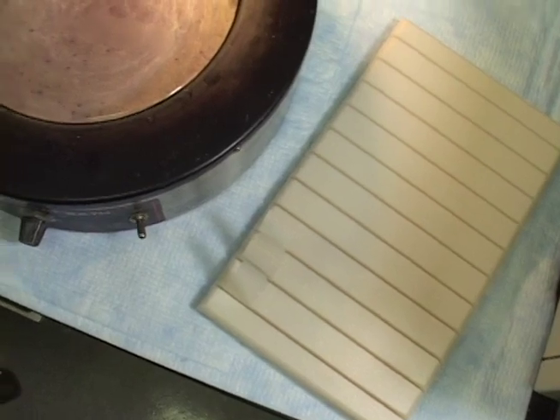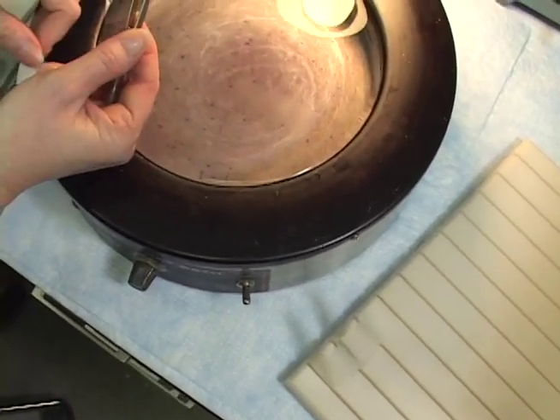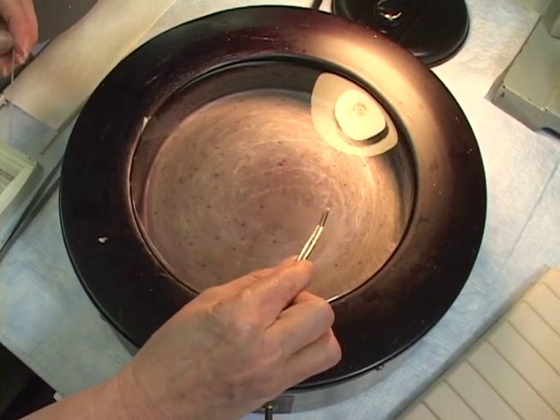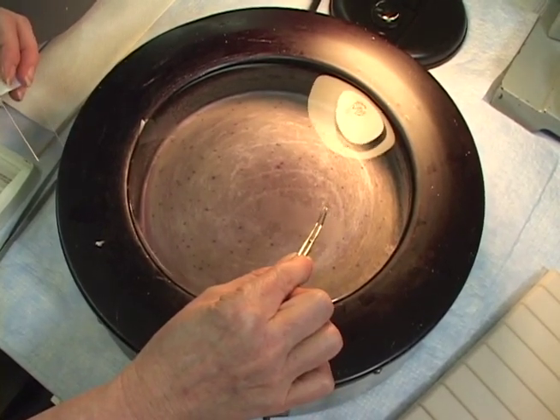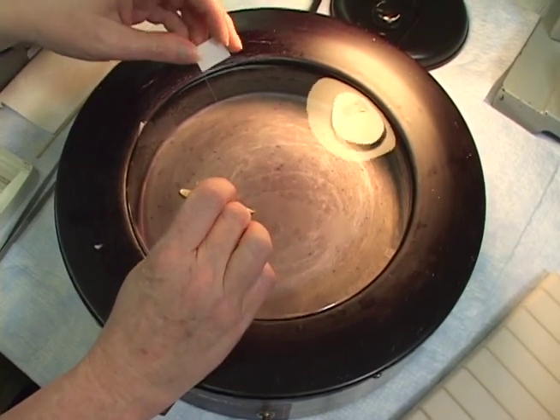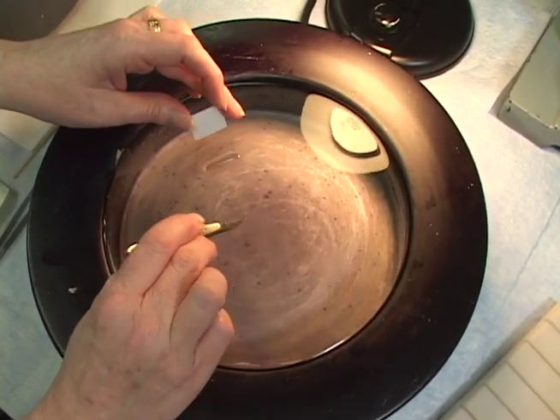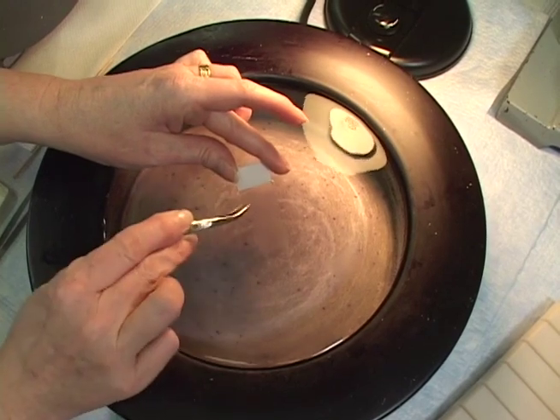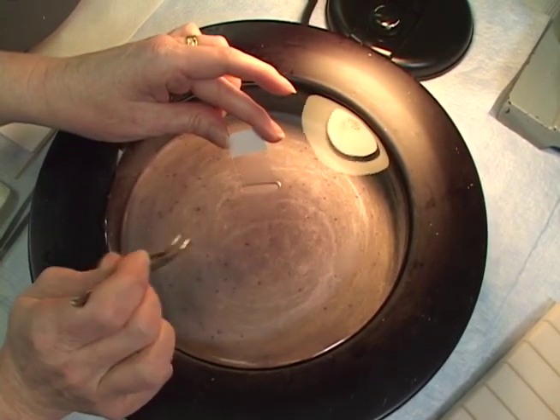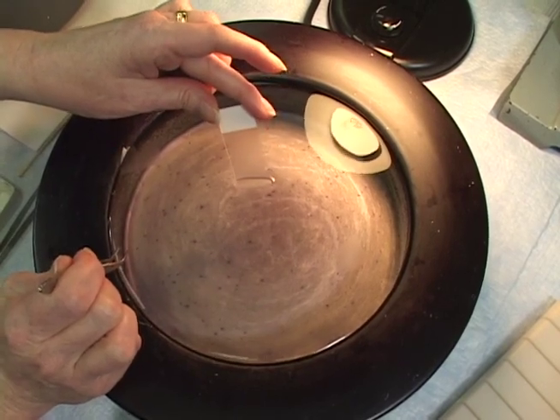Again, I'm going to separate the ribbon with the ball of this, not the tip, because it tends to stick more. It just doesn't seem to do as nicely. I mean, you find your technique and your method, but you get the idea. I'll gently steer it by just light touches. Maybe touch it there so it doesn't slide down, and gently pick it up.